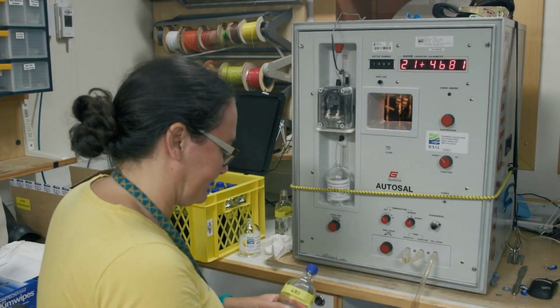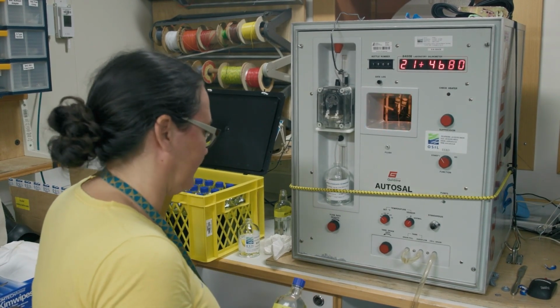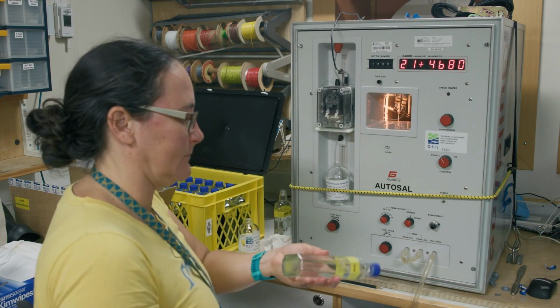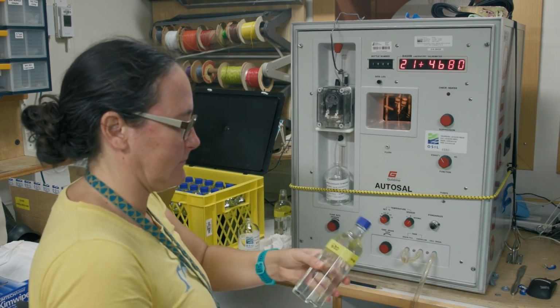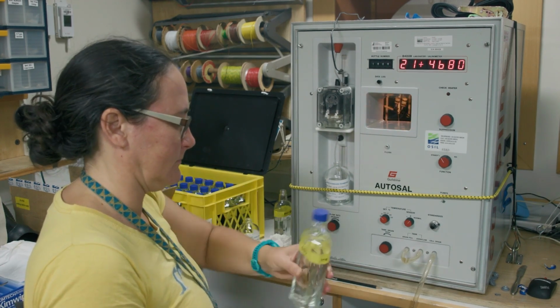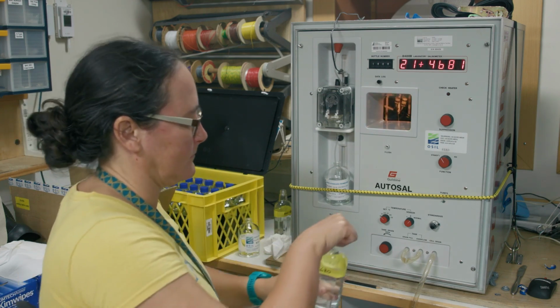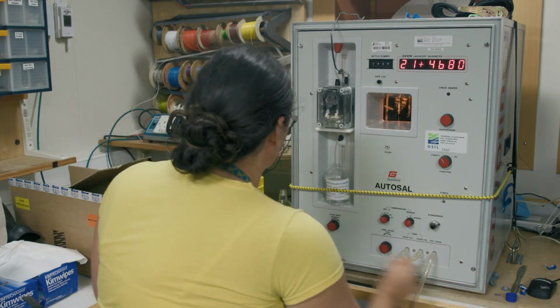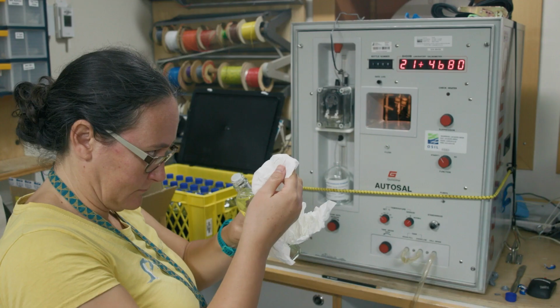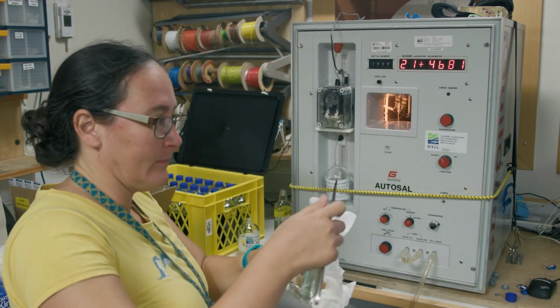This bottle here is full enough, so we log the label number, then gently agitate by overturning, again to mix the water without adding small air bubbles that could get stuck in the conductivity cell. We check that the insert has provided a good seal, then remove the plastic insert. A clean table knife is helpful here.